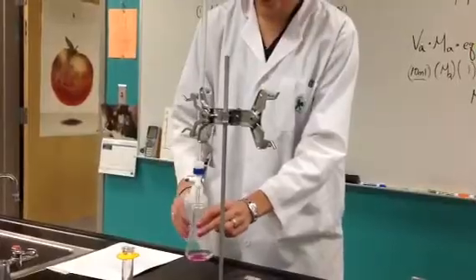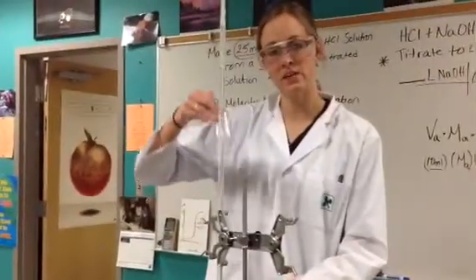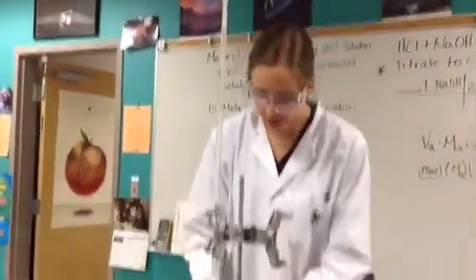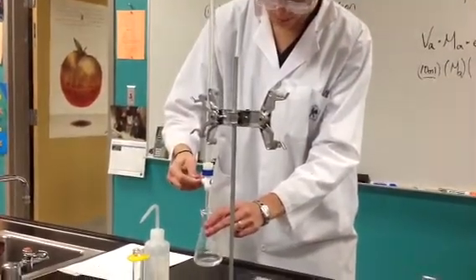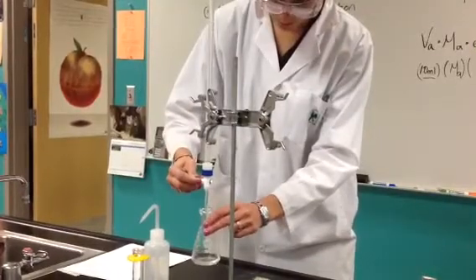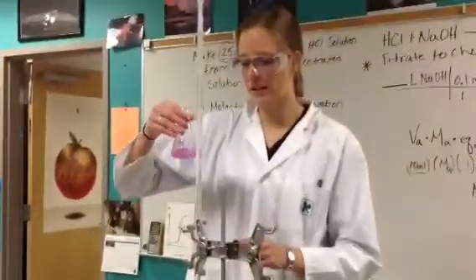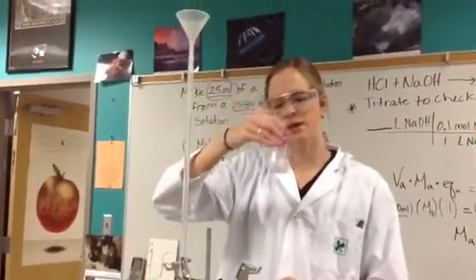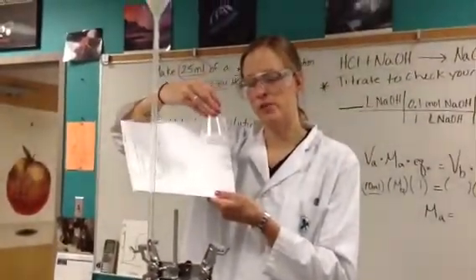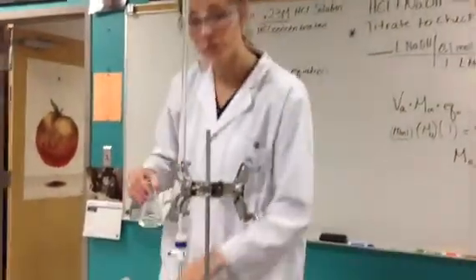Make sure you use your squirt bottle to get all of the base off the edge and end of the burette. Take it away from the bottom of the burette and swirl. The pink stuck around a little bit longer but didn't stay, so get one or two more drops in there. If you're not sure on the pink color, you can use a white piece of paper at your station. Be patient — sometimes you have to wait and the pink will disappear, so you need to go another drop.